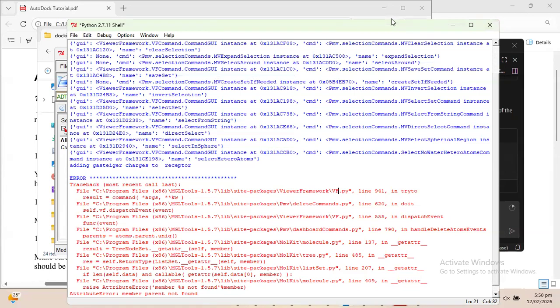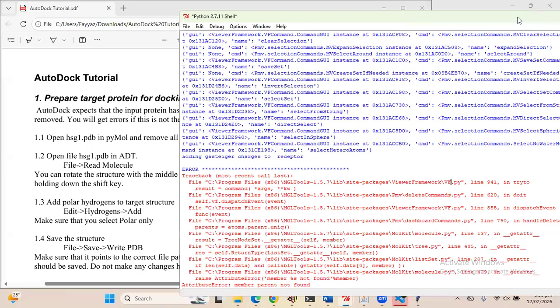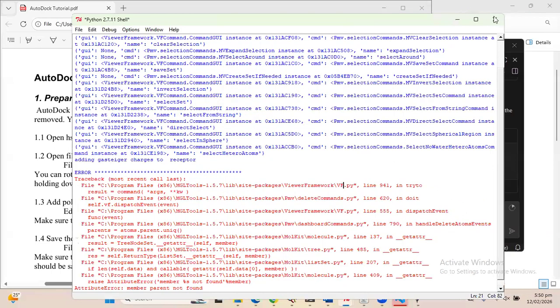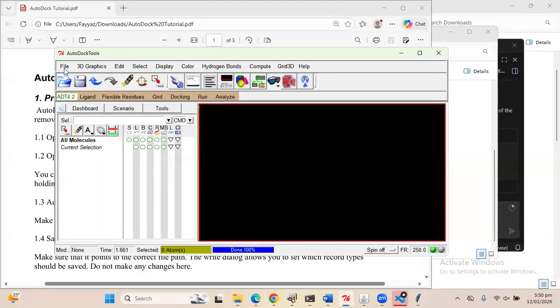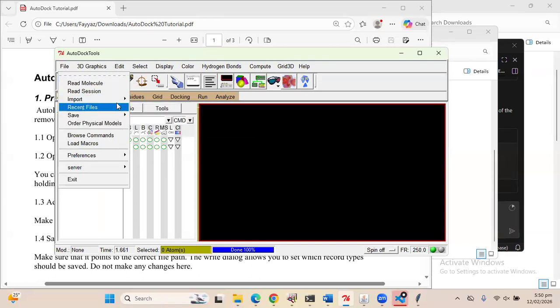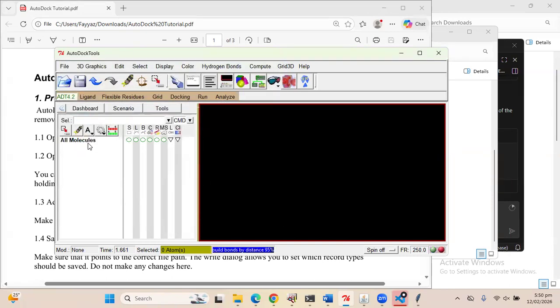I don't want you people to do that. I will check why it's causing some problem on my Windows, because I have selected the things, but it's not deleting them properly.